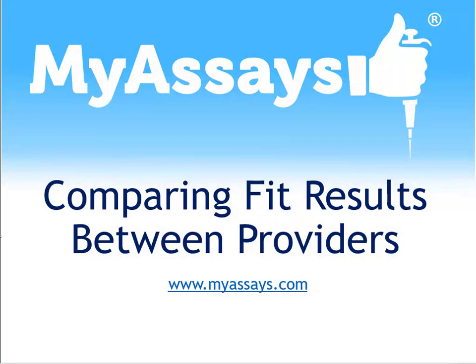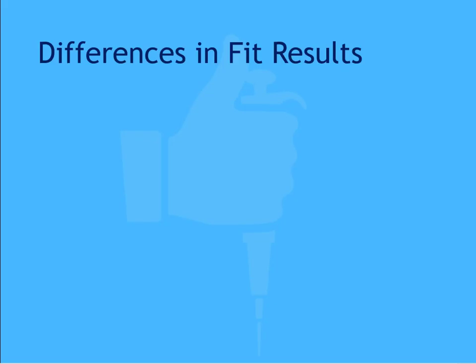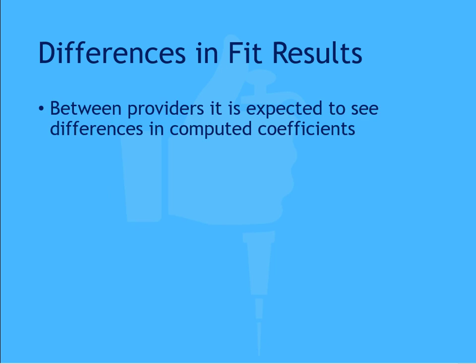In this video, I'll go over comparing fit results from different providers, specifically 4PL and 5PL results. When comparing the fit results of 4 and 5PL curves in MyCurveFit and MyAssays products and services with results from other providers, you may see some differences in the computed coefficients.